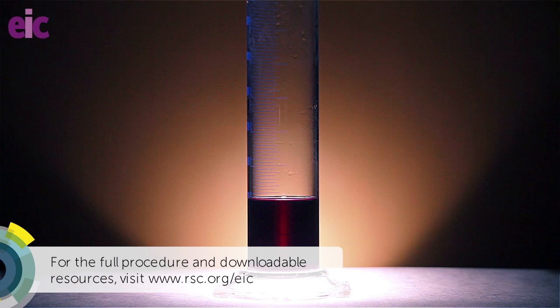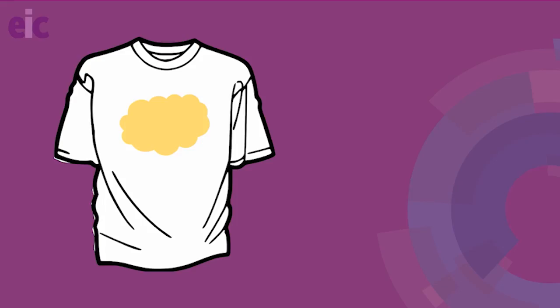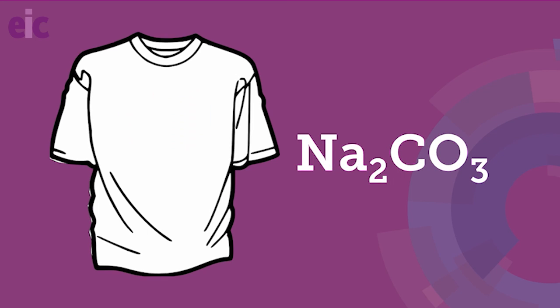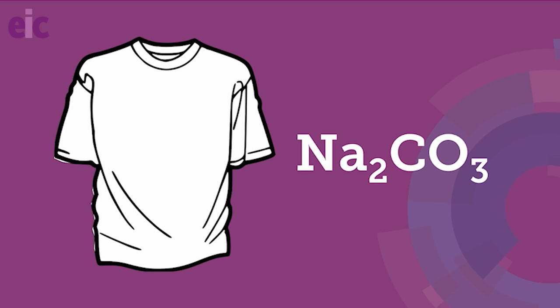Add some indicator to a solution of sodium carbonate and we see it turns purple. Its surprisingly high pH of 12.2 explains why it's commonly known as washing soda. It's alkaline enough to have some success removing fatty or oily stains from clothes, a little bit like a gentler version of the oven cleaner from before.